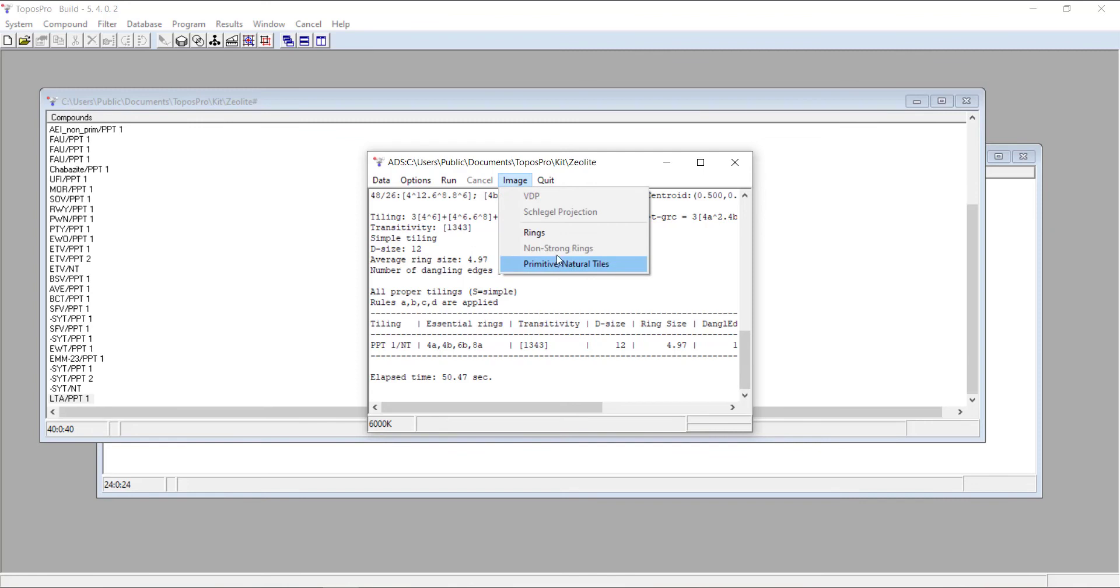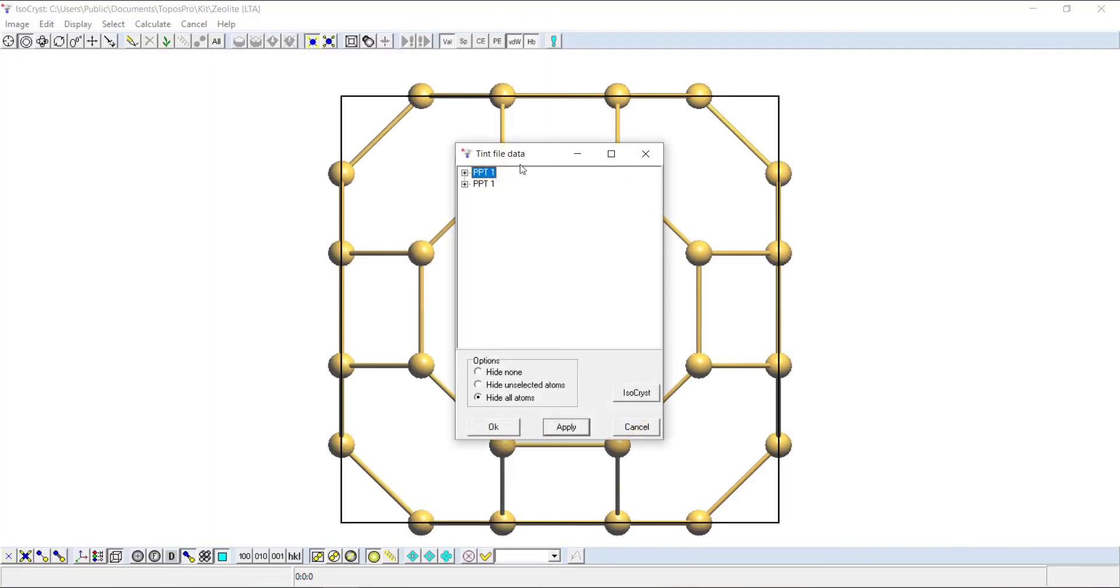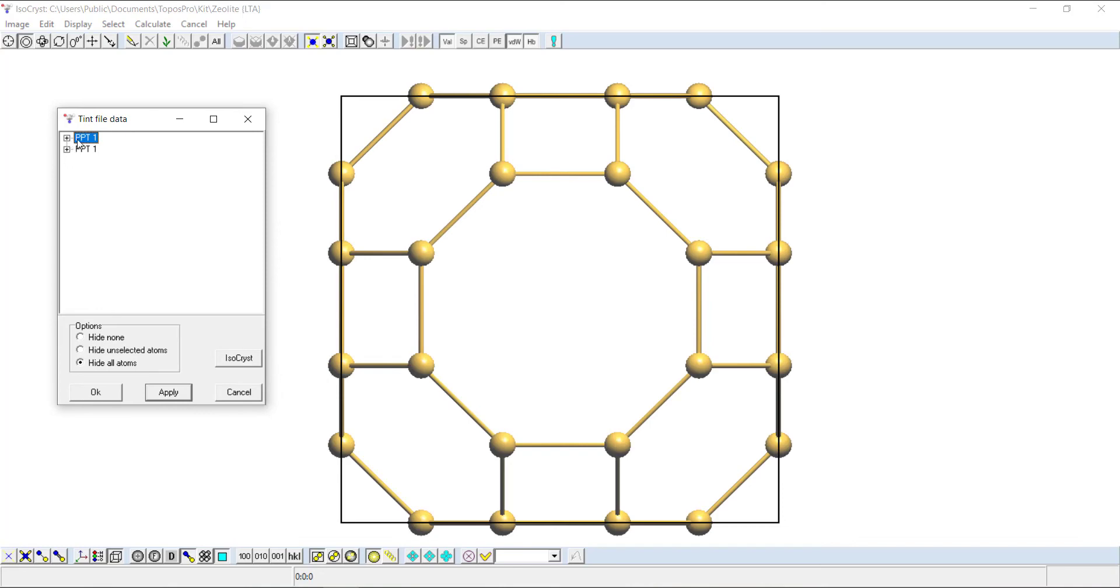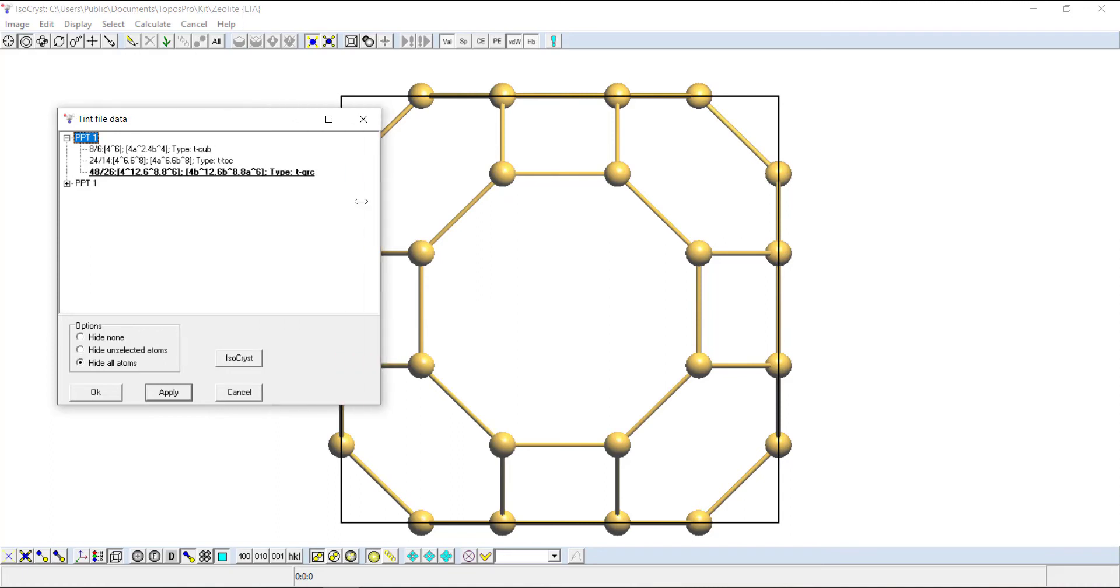If we click image, primitive slash natural tiles, that'll open an Isochrist window where you can visualize each tile at a time. It's got two tilings here, but let's just stick to the top one, PPT1. PPT stands for Primitive Proper Tiling.